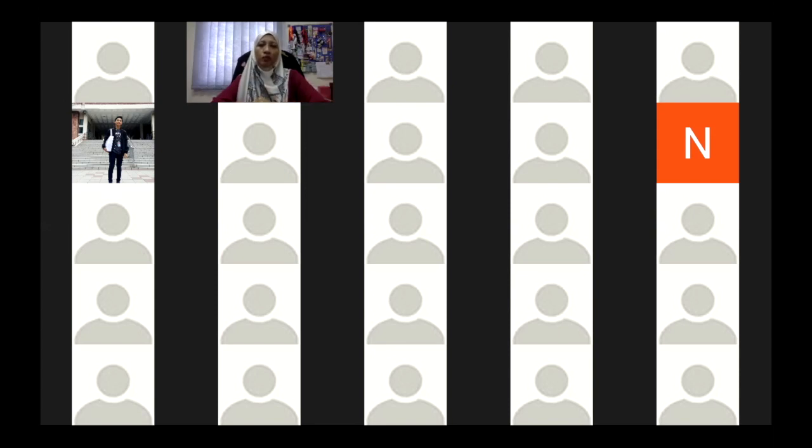It's mentioned that if you don't know what the compound is, MS usually has a library of compounds so you can identify what the compounds are. But in this case, if you just want to analyze A, B, and E, you already know you have A, B, E in your sample, and you're only interested in A, B, E, you can use GC without MS, because GC-MS is more expensive.